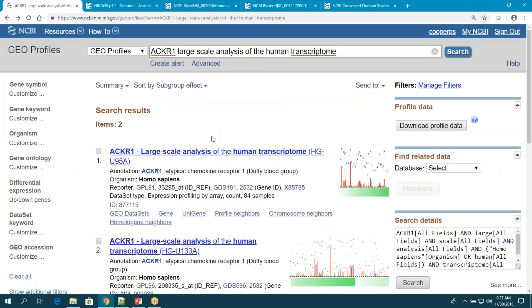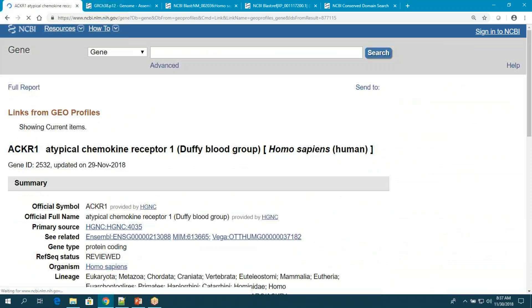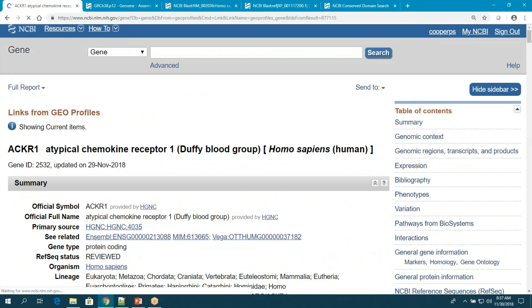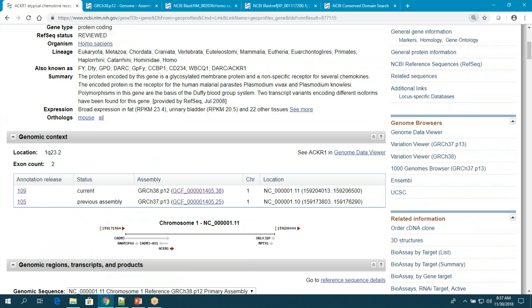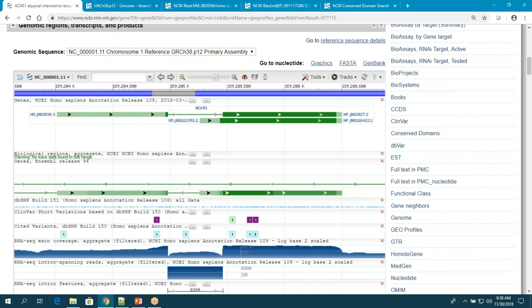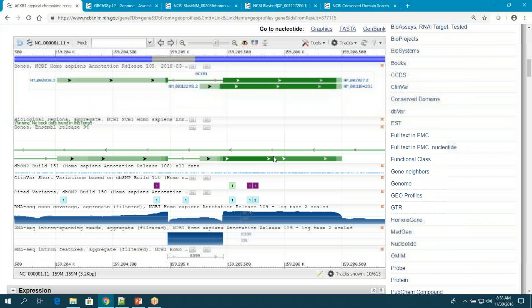Let's go back to the gene record and look at the variants. I'll link back through that link. There are lots of ways to look at variants, but I'm going to look at the graphical genome view. There are lots of tracks here, so I'll clean it up and get rid of tracks I don't want — I got rid of Ensembl annotation and a couple of others.